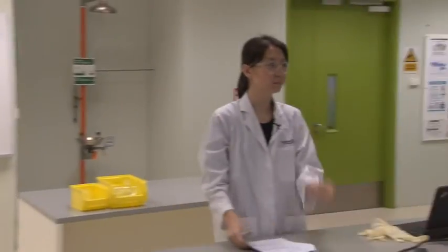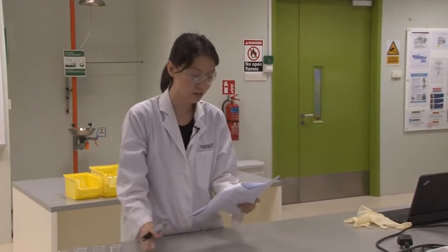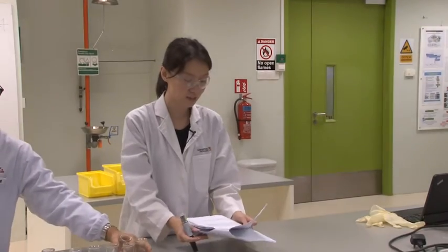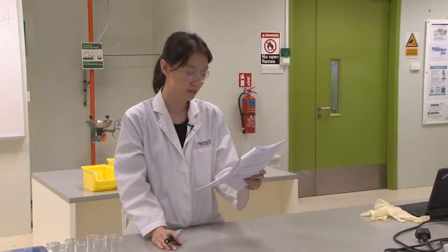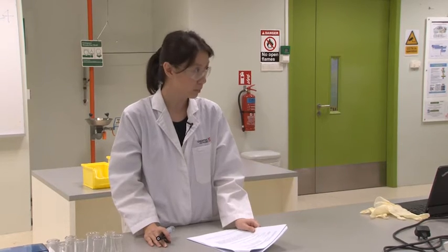Okay, everyone here? Okay, so today we're going to do experiment 5, which is the investigation of nucleophilic substitution reaction. So in the previous synthesis experiment, we have seen how we do organic synthesis for SN2 mechanism. So today we are going to investigate a different mechanism via kinetic studies, okay? So you have done a kinetics experiment before, right?